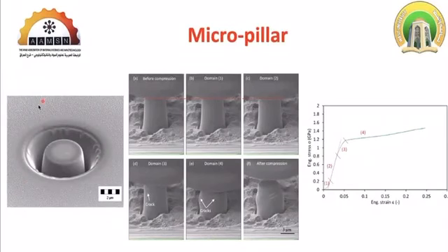Okay, so inside the SEM, we can use a mode called focused ion beam, where we can make different shapes, like this shape, which is called a micropillar. And then, by using the nanoindentation, we can push this micropillar under control by using a flat punch. So we do have a flat punch for the nanoindentation, and push this micropillar down, and monitor it, as we can see here, until we get some fracture.